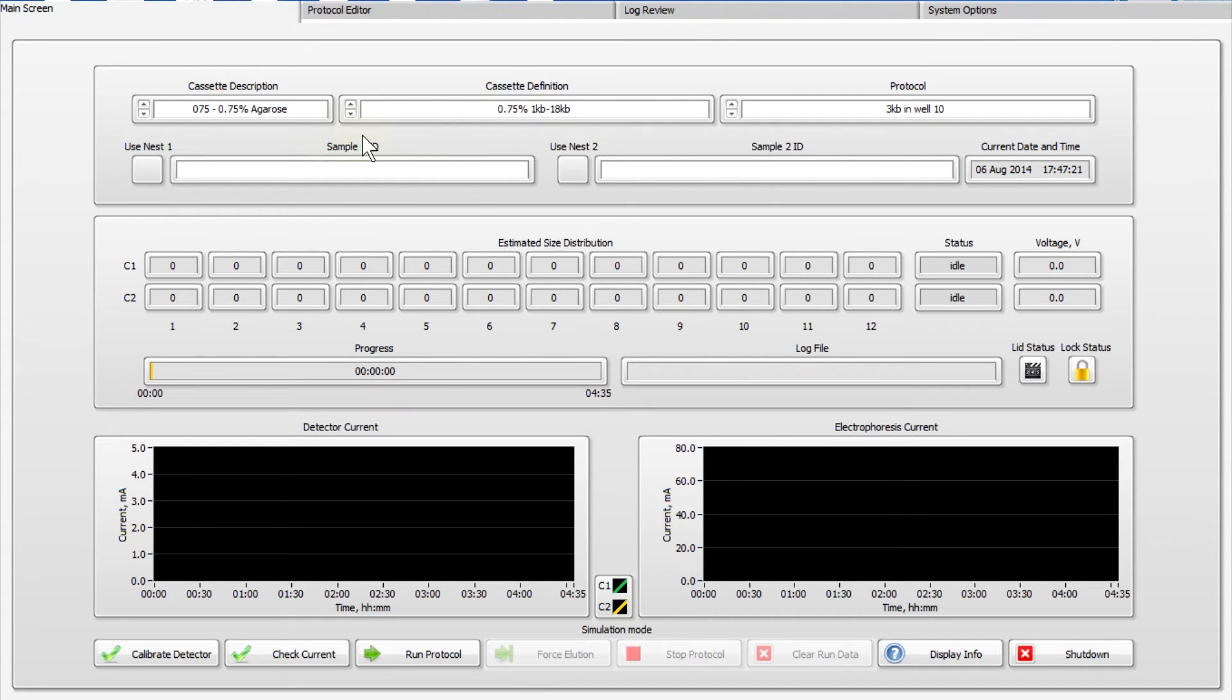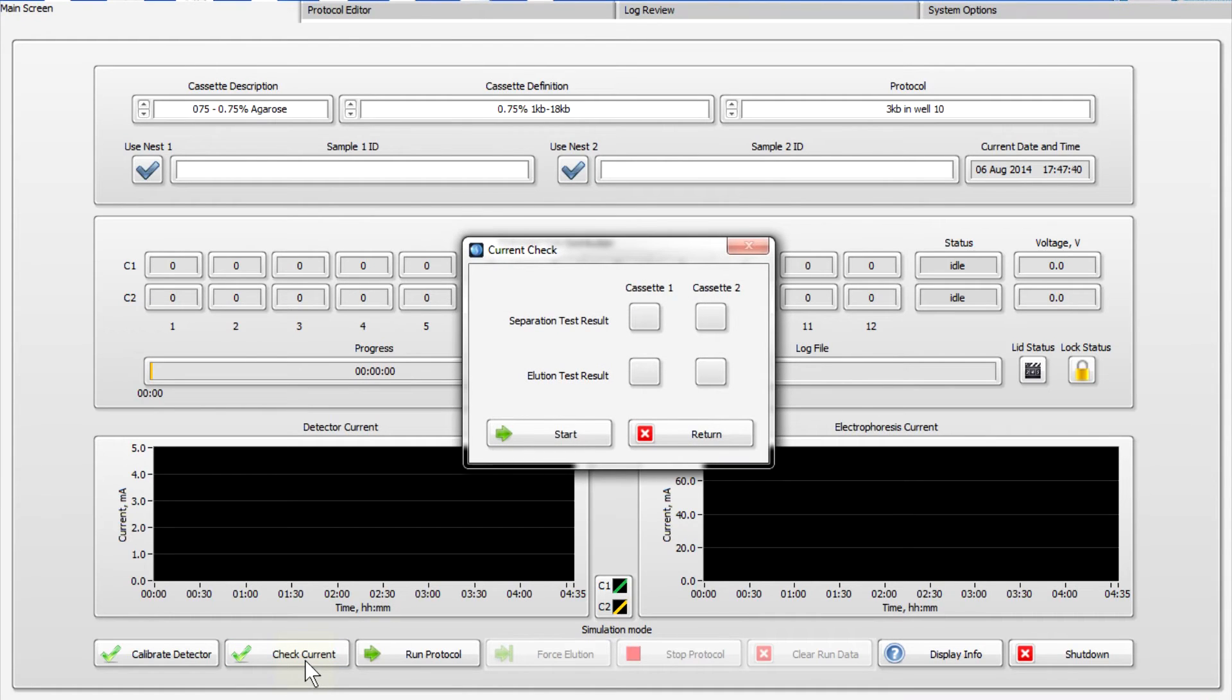Select the nest or nests onto which the cassette or cassettes have been placed. Press the check current button. You will hear the lid mechanism engage and the test will automatically proceed.